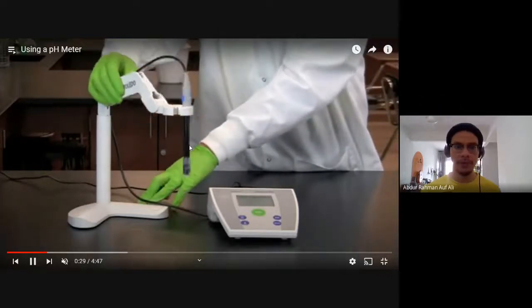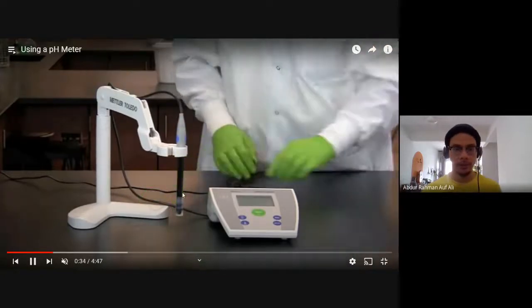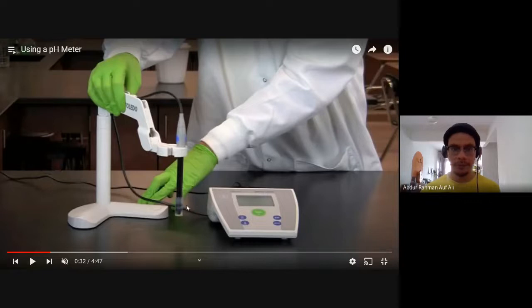So you perform this test by dipping this electrode into your test solution. At the end, wait a minute, say rewind. This is the tip of the electrode that is exposed, very sensitive. We cannot leave it exposed. Exposed until dry, I combine the two words. If it is exposed until it dries, it will be damaged. So we will dip it, we will soak it in a salt solution. Usually we use potassium chloride solution, salt water, so that it is hydrated.